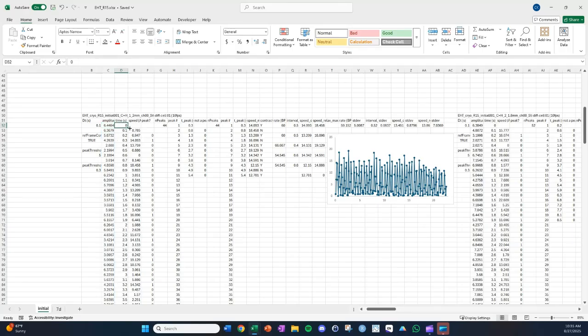And then using the delta t equals 0.1, I made a sheet here, which, if you want, you could make it like this, right? Plus this. And then you'd go down like that. But I've since just copied the values over. So that's how that timesheet was made. And then the speed, I just calculated from the prior values of the amplitude.